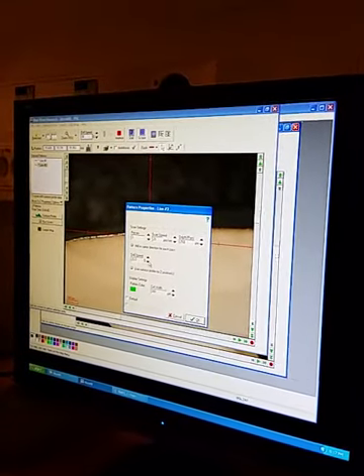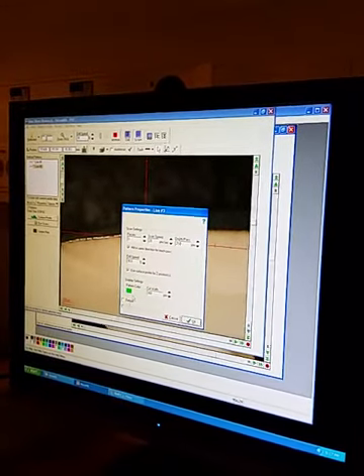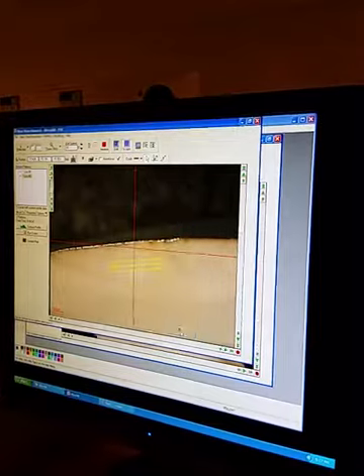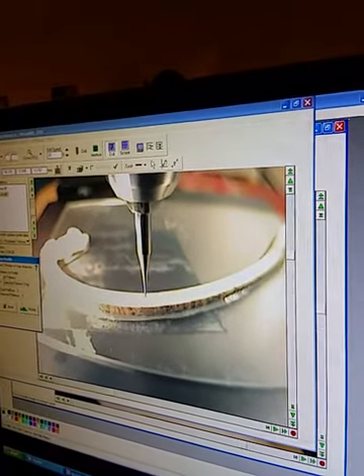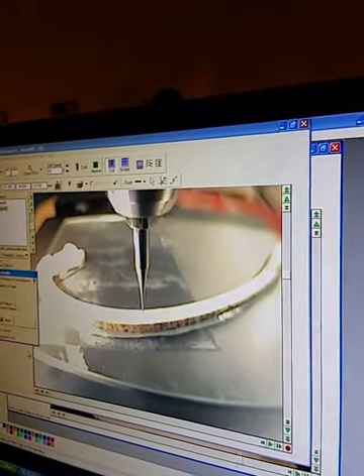Drill speed. I think you increased to faster, right? 30, yes. 30%. Use the Z. And we'll just set this as a default so we don't have to reset it. Okay. Now we do the surface profile. Where did you find that? Not all patterns, only a selected pattern. Profile. Oh yeah.